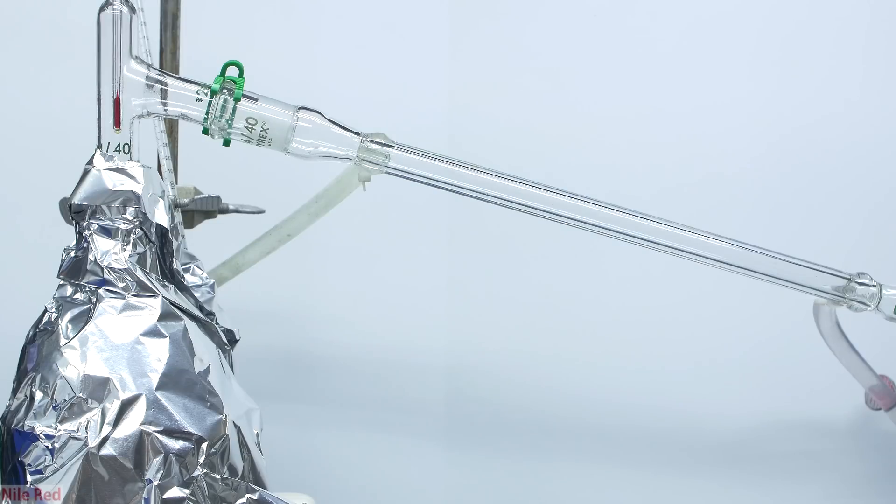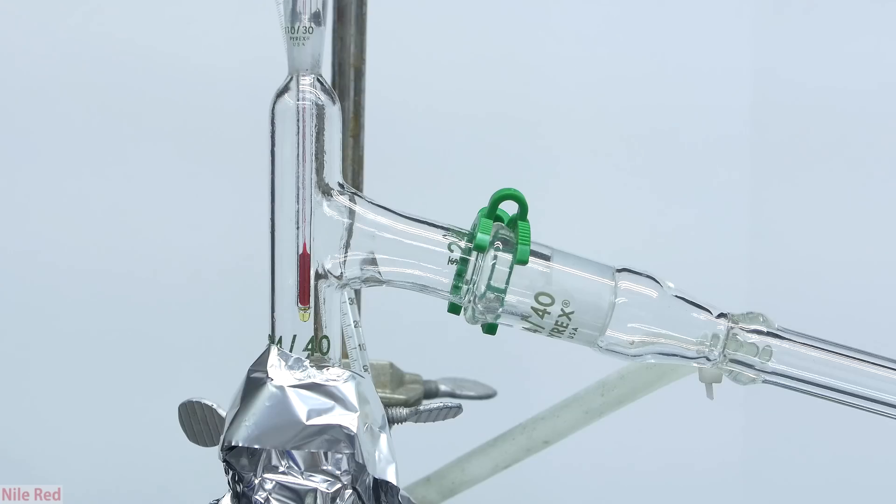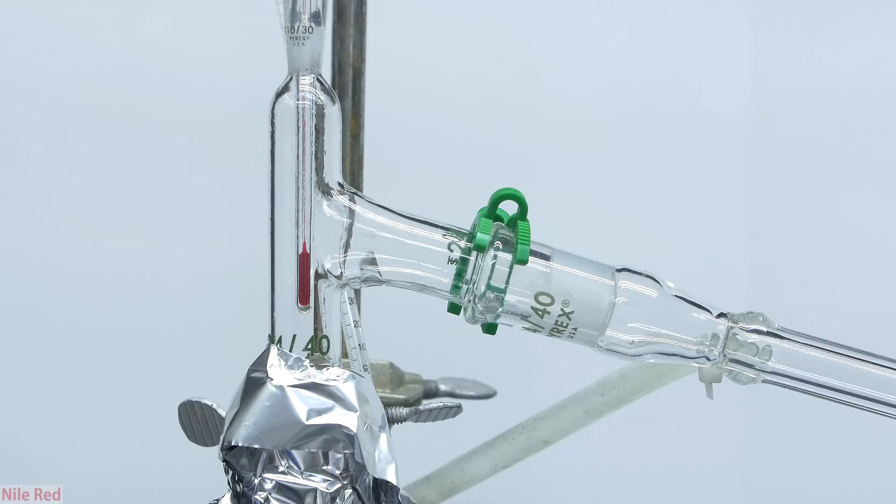To help the methyl iodide make it over and to prevent it from condensing on the walls of the round bottom flask, I just decided to insulate things with a little bit of aluminum foil. Just after heating it for a little bit, you can see we start to get drops forming on the thermometer and shortly after we get methyl iodide coming over into our receiving flask.